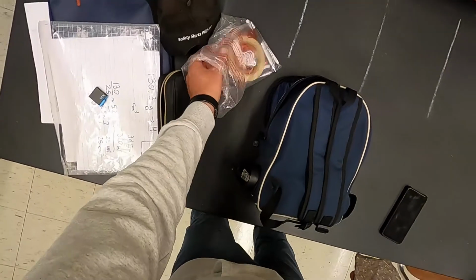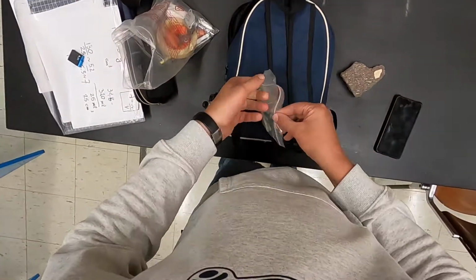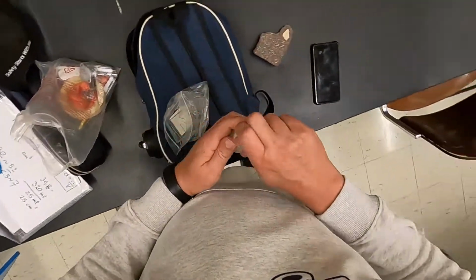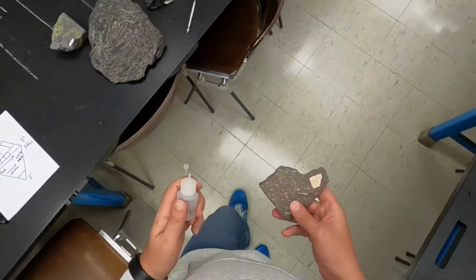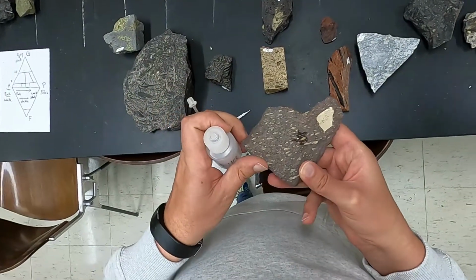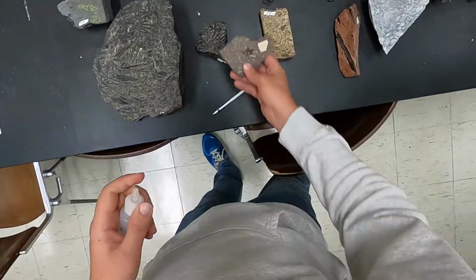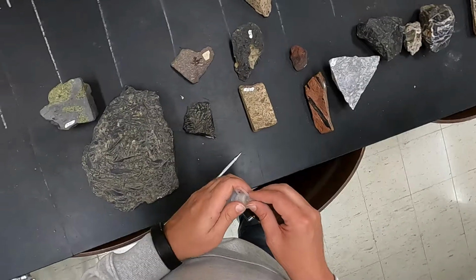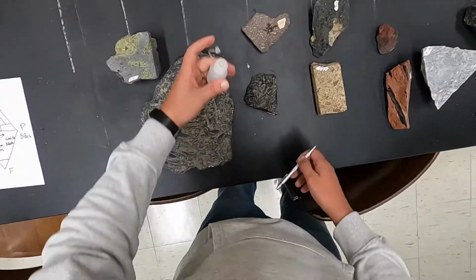So if we pick up the acid, which I think it's in here, and we test it very rapidly, we should be able to test if it's... it doesn't look like carbonate because it doesn't fizz very much. So in this case, I would be more inclined to think that that's quartz, because also of the hardness.